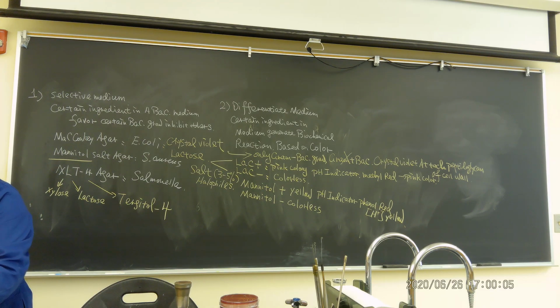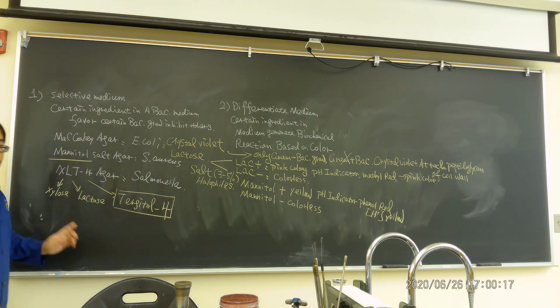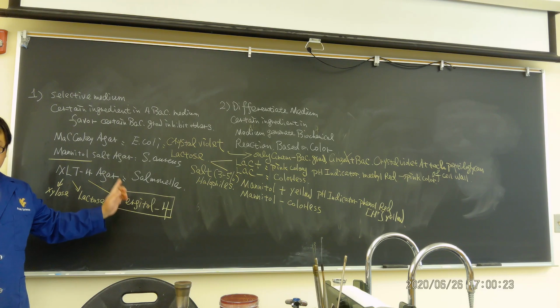Yeah, lactose. The selective ingredient of this XLT4 agar is Tergitol. It is a very strong selective ingredient. Most other cells, except the Salmonella cell, will not grow there.